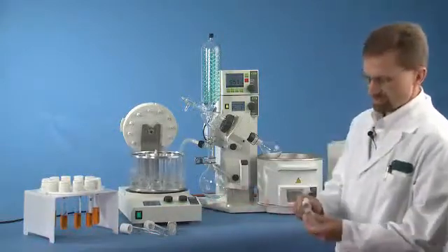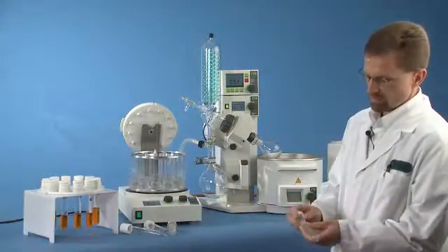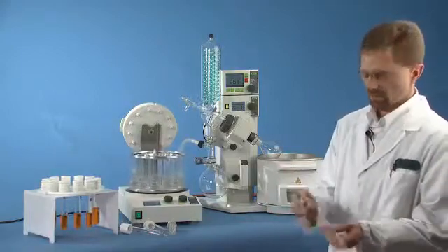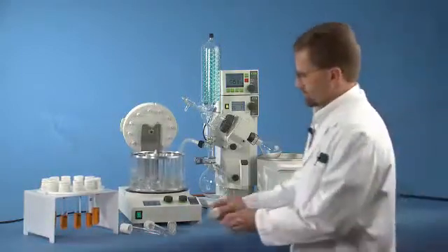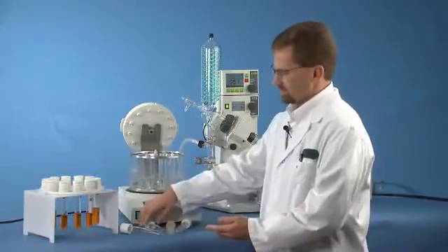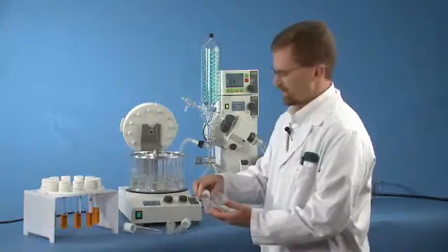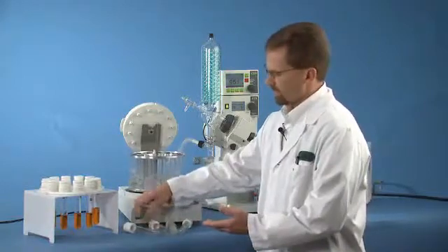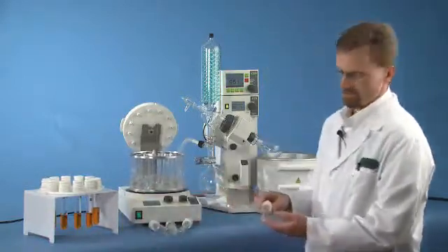For example, we have an adapter that fits to a threaded test tube. So we have a sealing mechanism in the top, or a falcon tube with a pointed bottom, a scintillation vial flat bottom, or a parallel synthesis reaction vessel from Radley's.